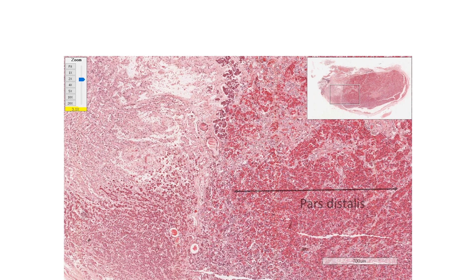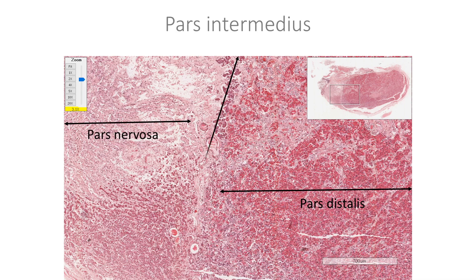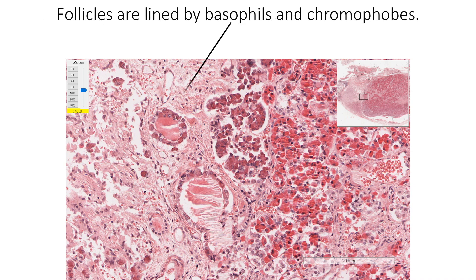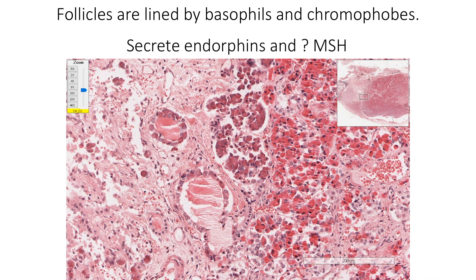Pars intermedius is located between the pars distalis and the pars nervosa. It shows colloid-filled follicles, and the exact content of the colloid is largely unknown. These follicles are lined by basophil cells as well as chromophobe cells. The basophil cells secrete endorphins and possibly melanocyte-stimulating hormone in humans.